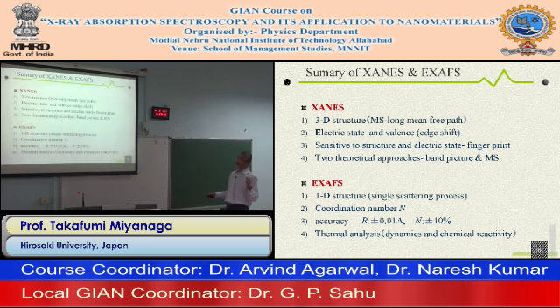It is a very accurate technique for the interatomic distance. The coordination number has a little higher error, but 10% is the accuracy.